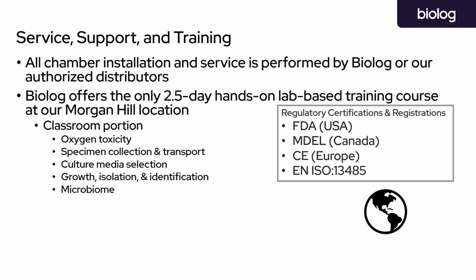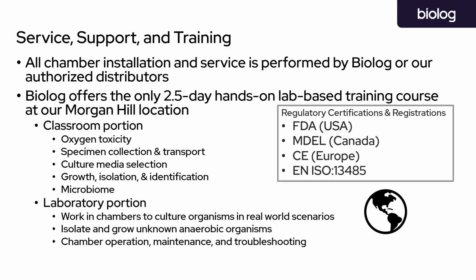In the lab portion, you'll get extensive hands-on experience with working in the chambers in real-world scenarios, focusing on isolating and identifying anaerobes using determinative culture media. Finally, you'll have ample opportunities to learn more about the operation and maintenance of the anaerobic chambers, as well as detailed troubleshooting information, just in case.